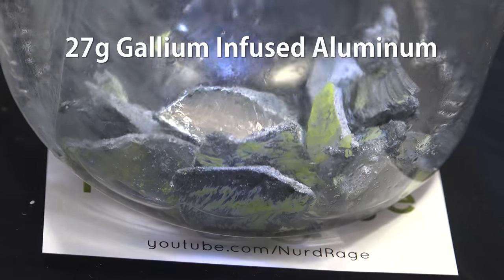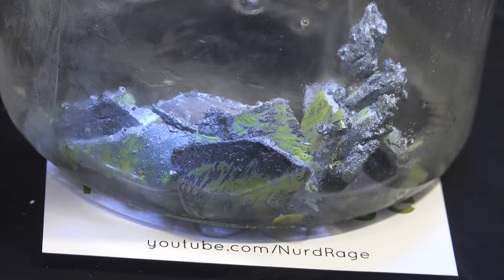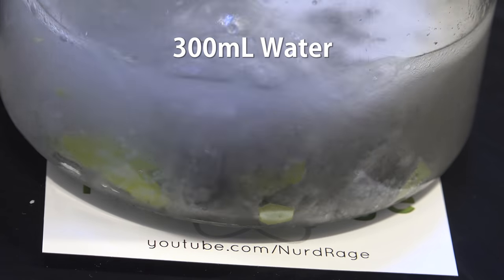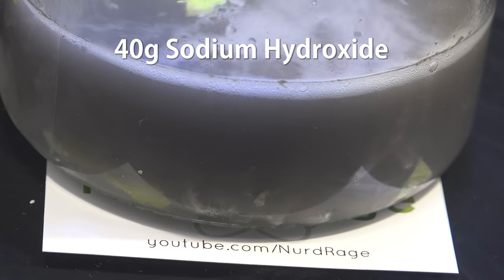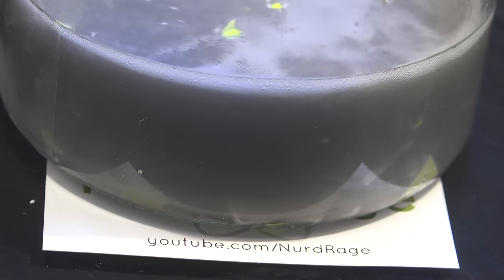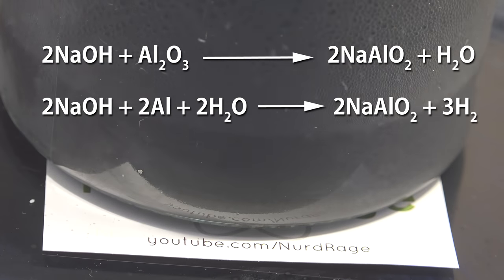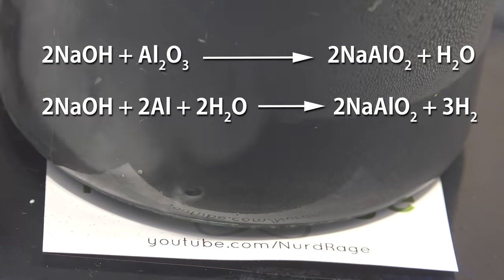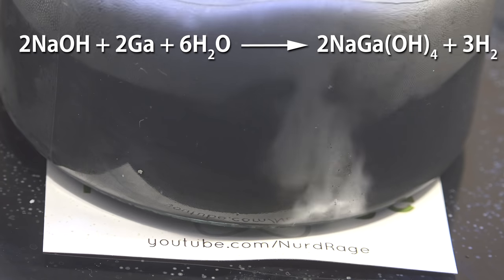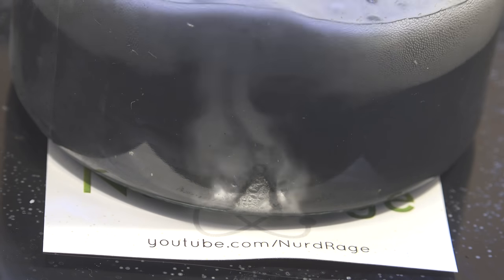First we get some gallium-infused aluminum — in this case about 27 grams — and to this I'm adding about 300 milliliters of water. Now in small portions we add a stoichiometric equivalent of sodium hydroxide, so I'm adding a total of 40 grams. Sodium hydroxide is highly corrosive to aluminum and it dissolves the aluminum oxide layers to form sodium aluminate, allowing the aluminum underneath to be attacked and also forming hydrogen gas. Gallium metal also gets attacked by sodium hydroxide, but that reaction is much slower, so for now the destruction of aluminum is the dominant reaction.